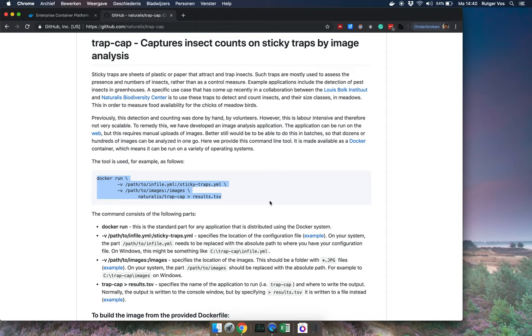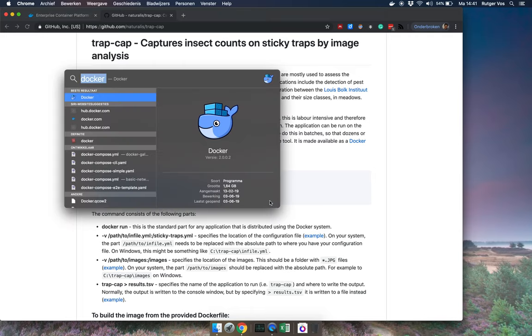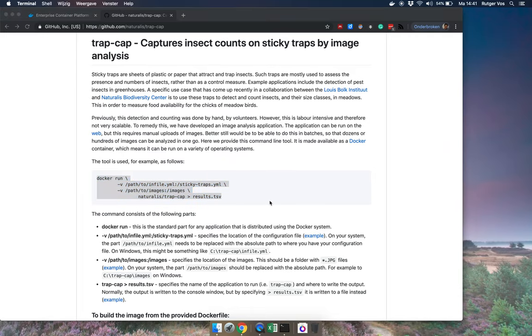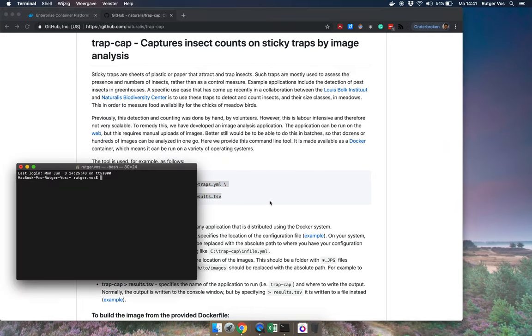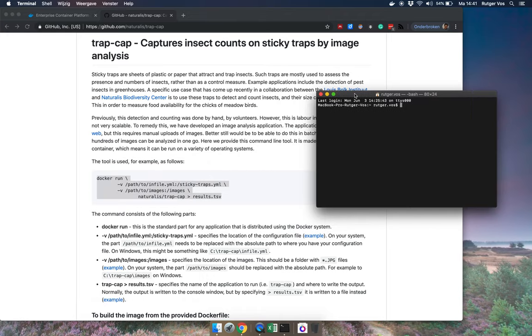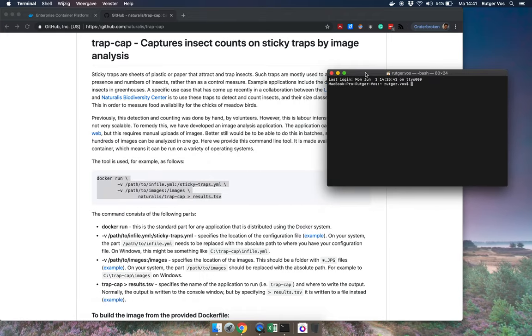And actually this part right here, this is the part that matters. So this is how to run the tool locally, which is by typing a command. And so on my Mac I do that by running a command in the what's called the terminal.